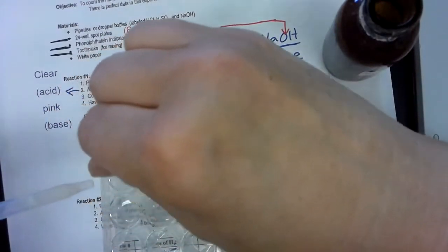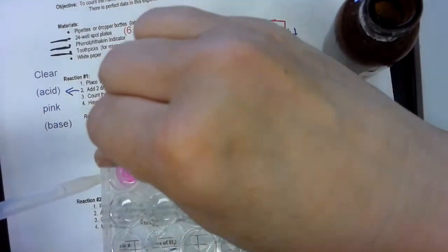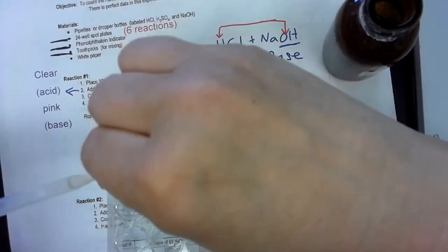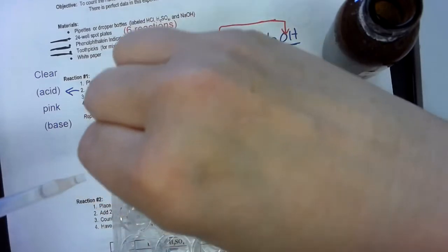And you can tell it goes clear. And then we're going to do 6, goes clear, 7, it goes clear, 8, 9, and then we have 10. And then it actually goes and it's not done. See how it's not done?